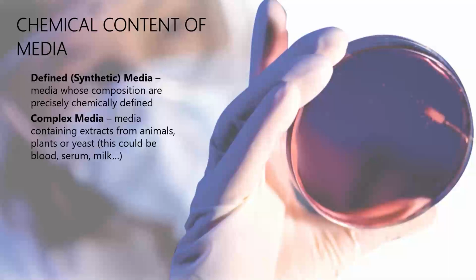Defined has a very specific chemical composition. So it's a recipe that is highly repeatable. It's going to be the same if I make 200 plates, all of them should be identical. Complex media is media that contains extracts from animals, plants, yeast, things like that. So it would be like, I often use sheep blood agar.